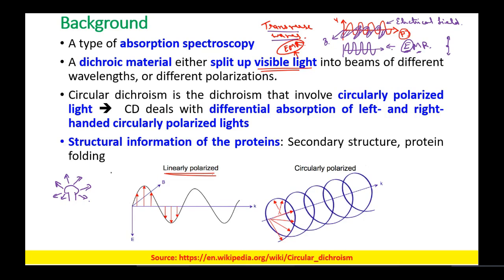So usually the propagation of the light is shown in this way. In between there is a 0 point and it moves upwards and downwards. However, the light beams are being propagated in all directions.